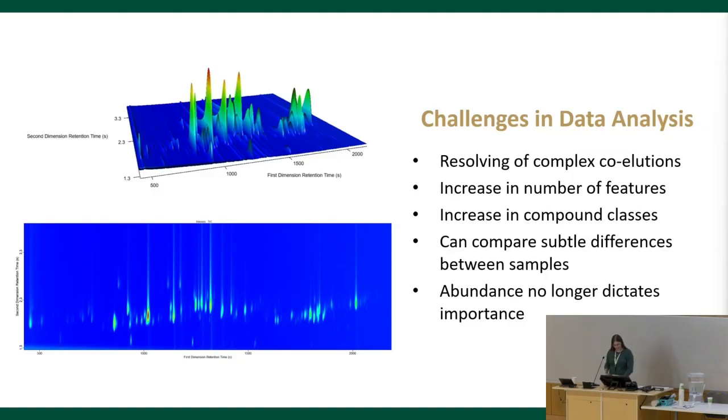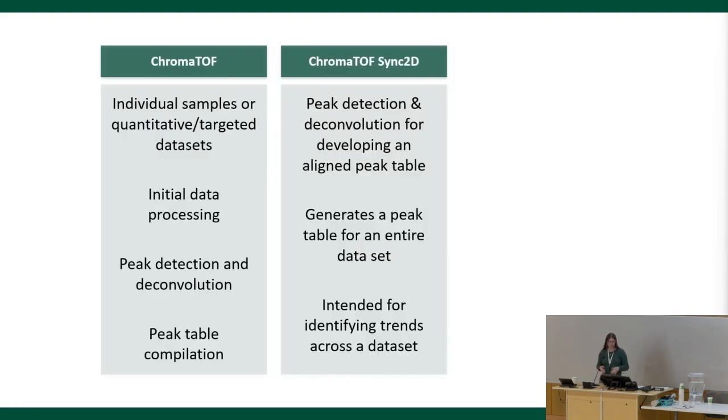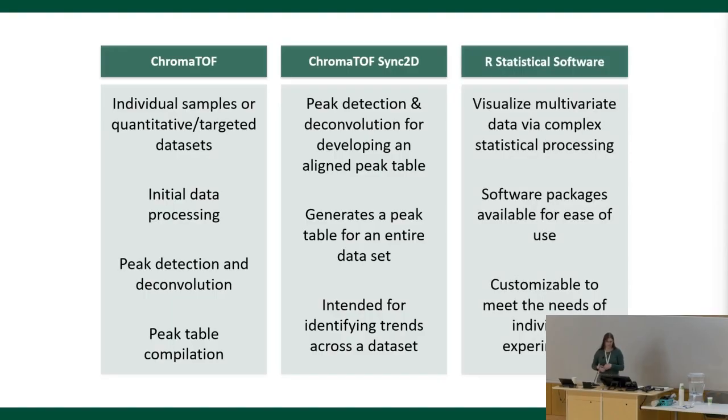To deal with these challenges in our lab, we have access to the full suite of software that LECO provides with their GC×GC TOFMS systems, including ChromaTOF and ChromaTOF Sync 2D, and we supplement this with open access programs like our statistical software. For ChromaTOF, we really use it for a lot of initial data processing. It's good for peak detection and deconvolution for single chromatograms at a time, and good for compiling peak tables for one chromatogram at a time.